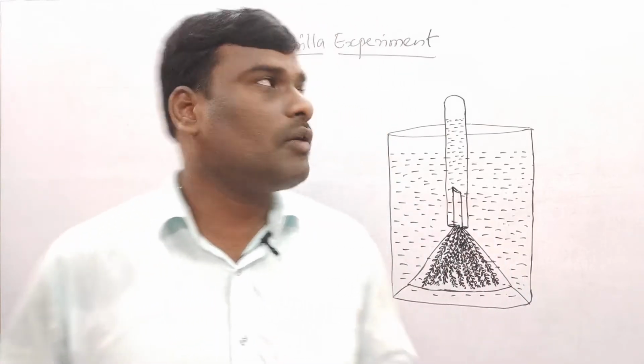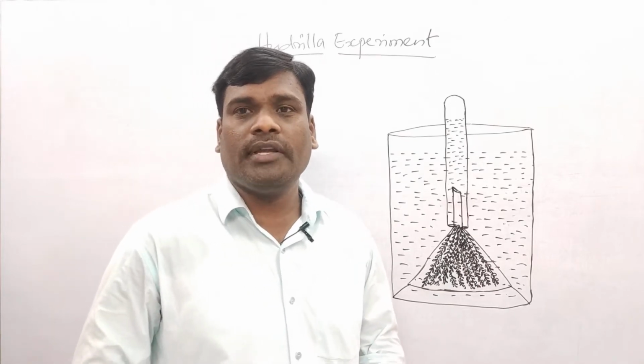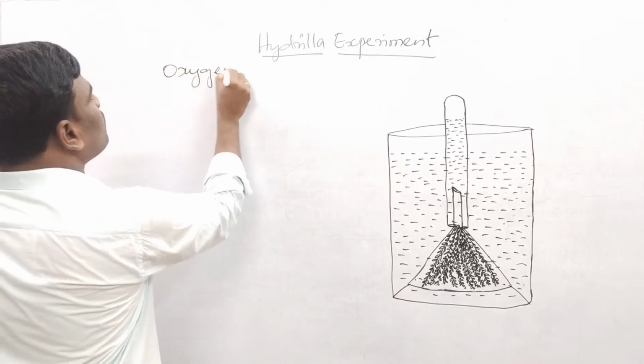Hi children, in this video we are going to learn about this Hydrilla experiment. With this Hydrilla experiment we are going to prove that oxygen is produced during the process of photosynthesis.